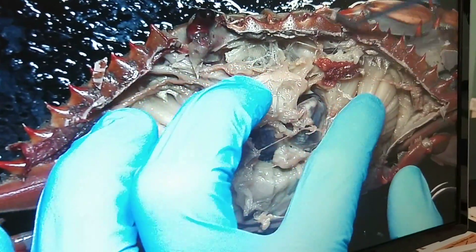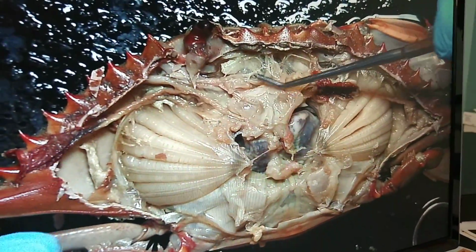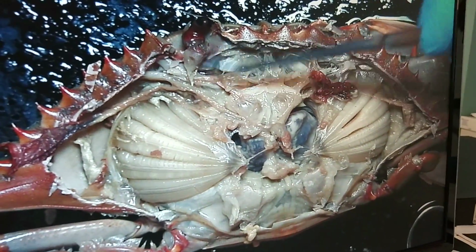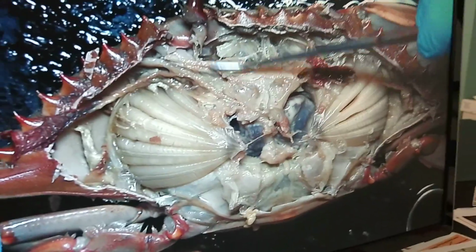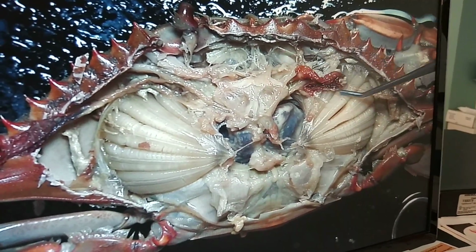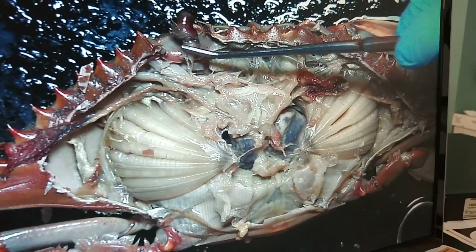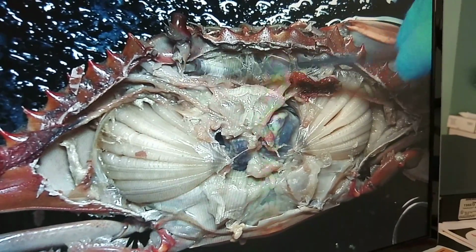Oh, your little eyes. Just a dangle. Compound stalk eye, you know. Right. So what's at the base, basically, of each eye? Ommatidia, or whatever. Those are the receptors. Right, ommatidia. There's bladders right here, right?